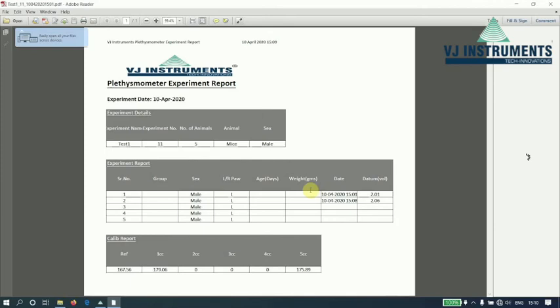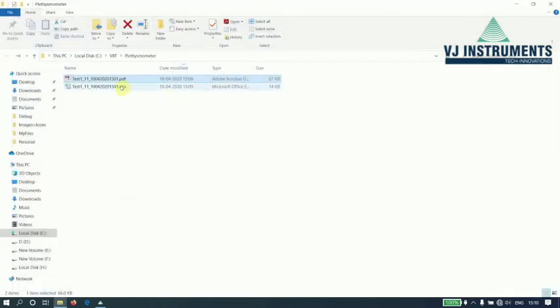So, this is the report. And this is the Excel report.